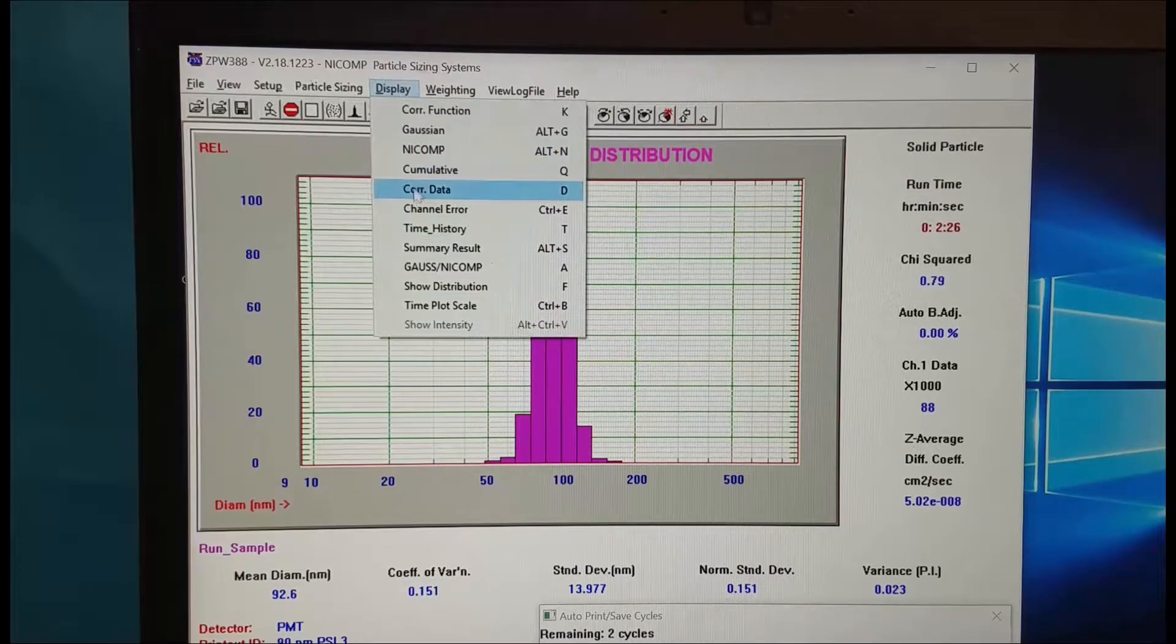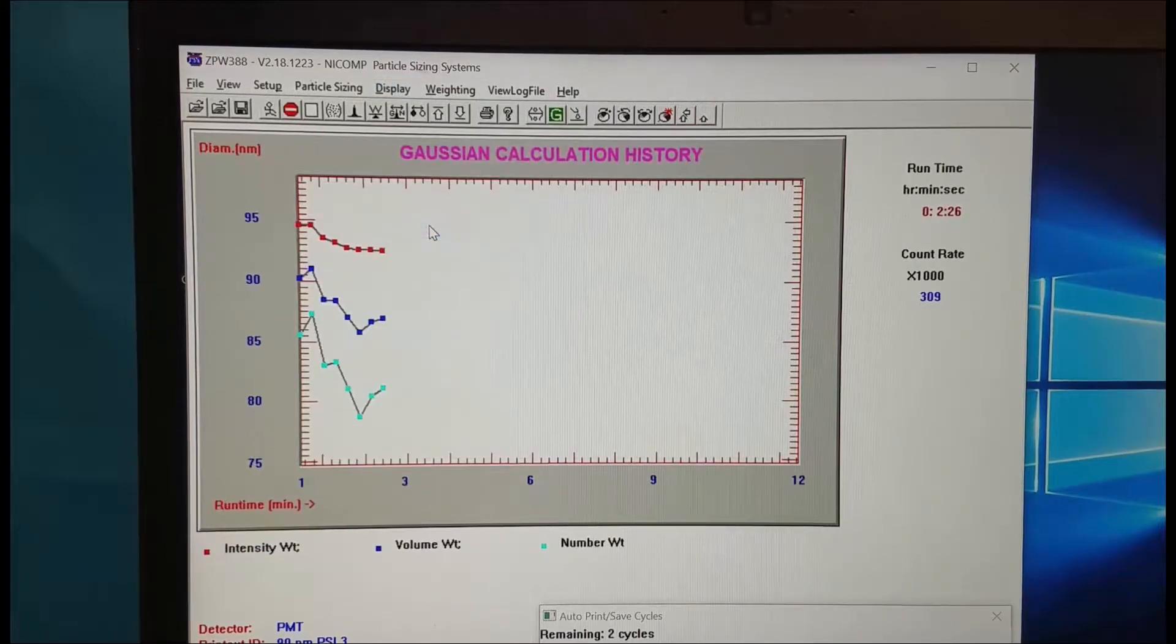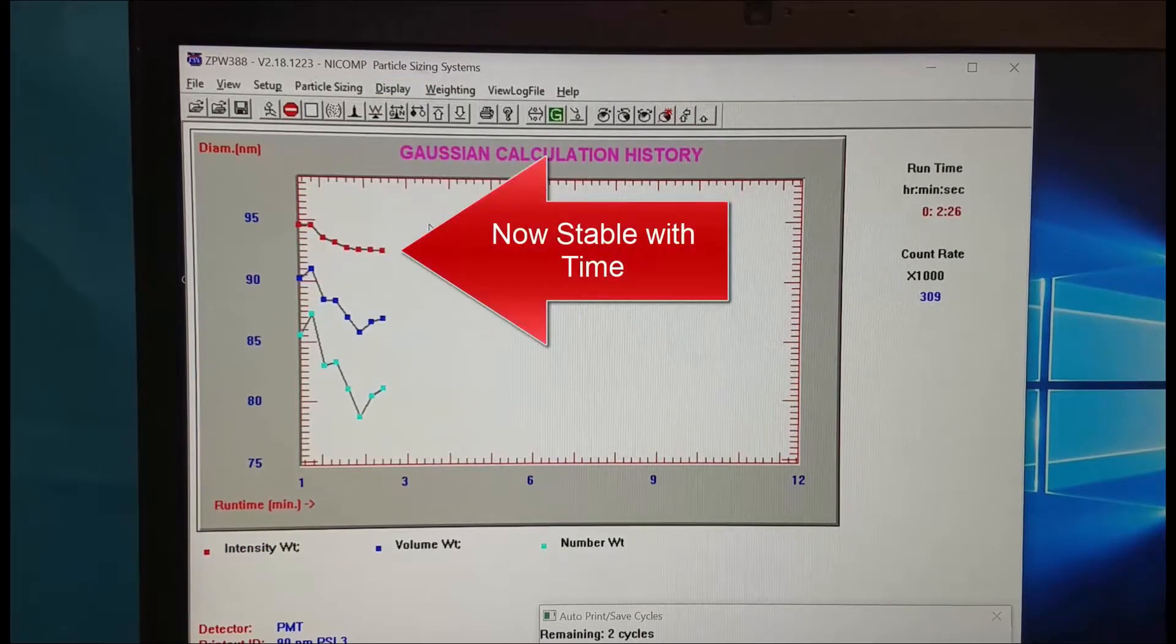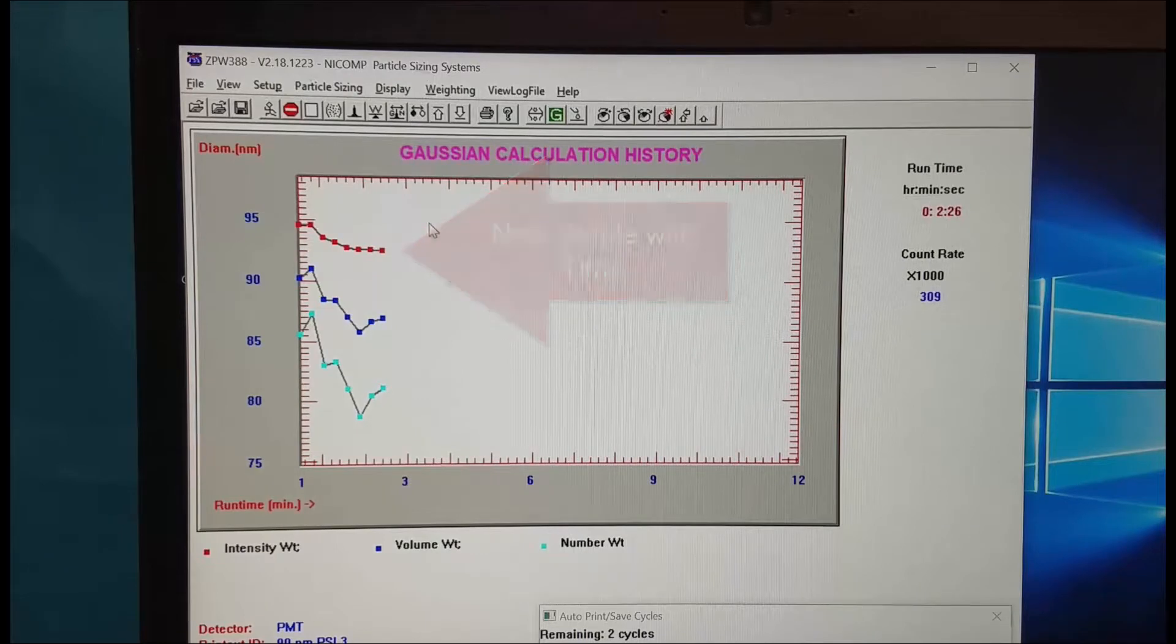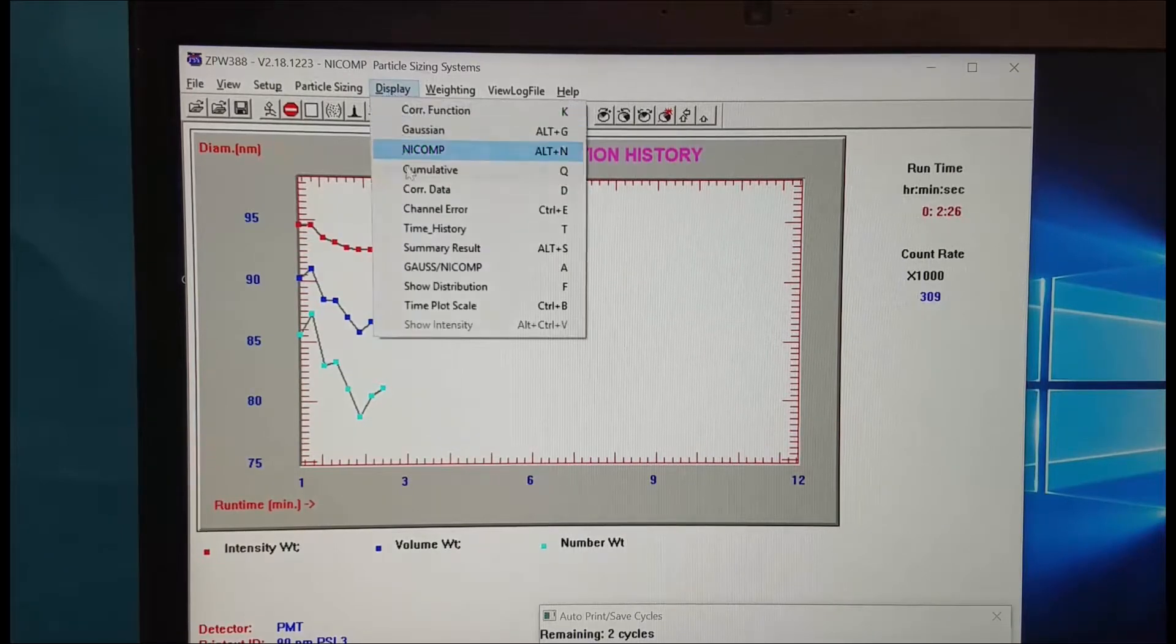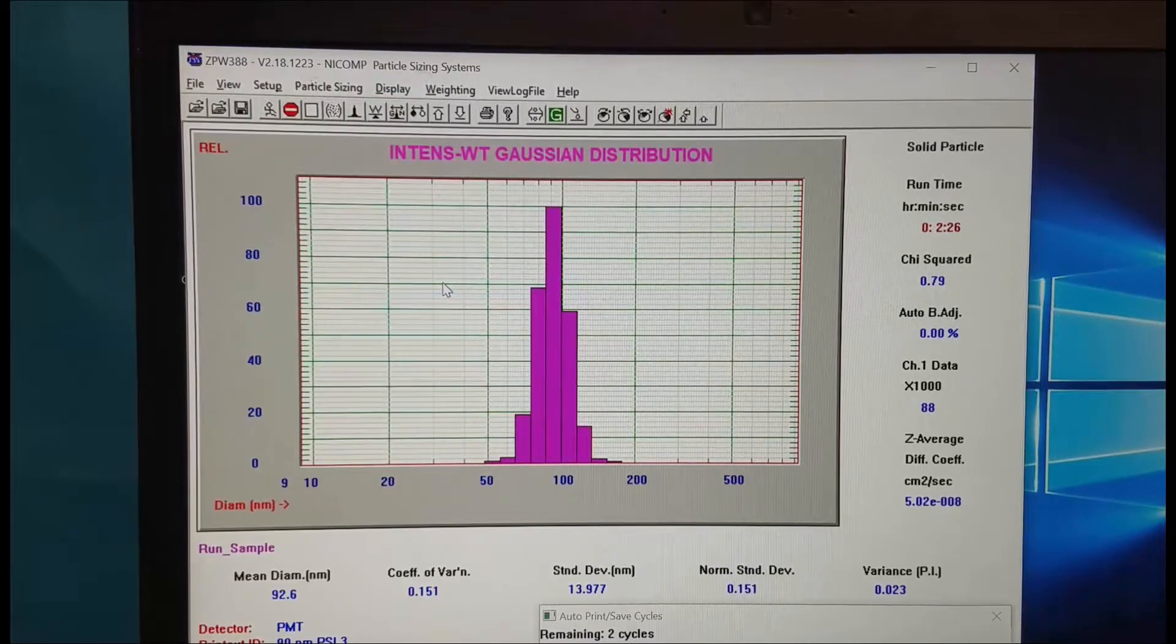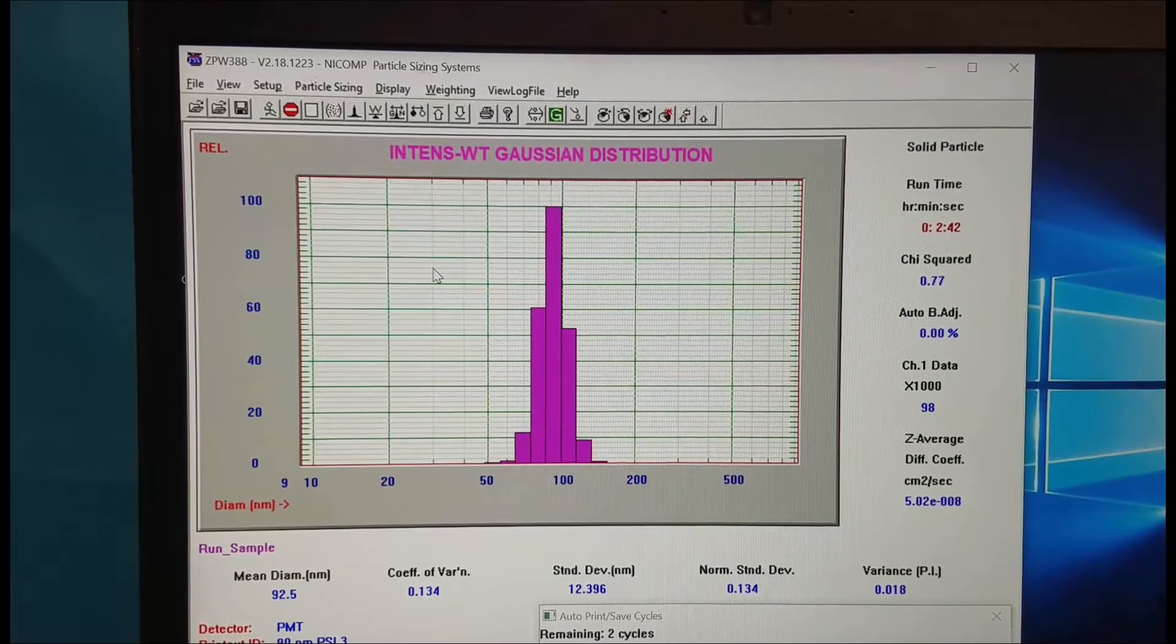And if we come back to display and look at time history again we see that the red intensity weighted mean is now stabilizing. So you can see with this sample after about three minutes we have measured long enough to get this nice stable result.